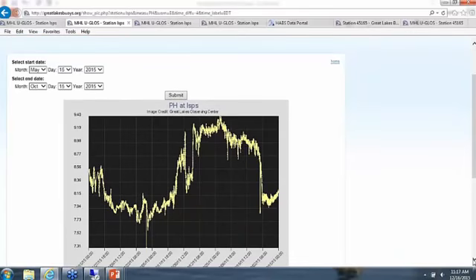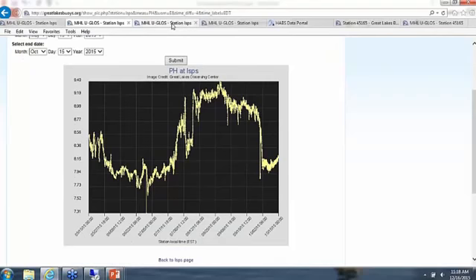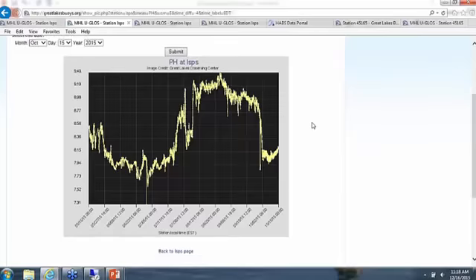So you're looking at pH from May 15th to October 15th of this past year. One of the things I said is that when you're monitoring and looking at these blooms in your source water, blue-greens and normal green algae use CO2 in the photosynthesis process. You can see in this slide where during spring runoff, pH has dropped down and at one point reaches just below 7.6. Then coming into summer and the height of the bloom, you have a pH of 9.4 in the raw lake water coming into low service. That's a significant pH swing between spring and summer, and then back into fall, where it drops back down. So you can set any dates you want to look at graph data.